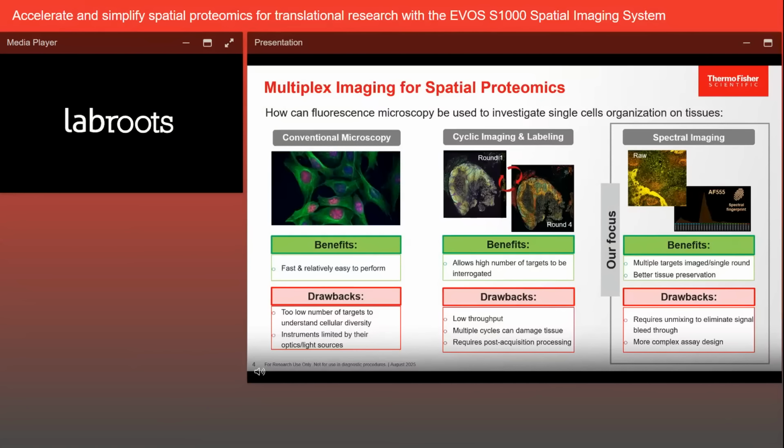In general, we can capture much more than 4 fluorophores in a single round. Because we capture so many in a single round, there is no need for stripping steps, and the illumination of the tissue is also much less. Therefore, there is much less likelihood of photobleaching, and consequently better tissue preservation.